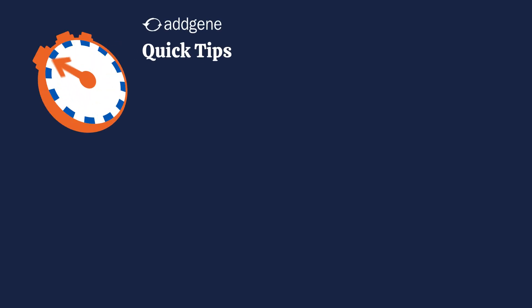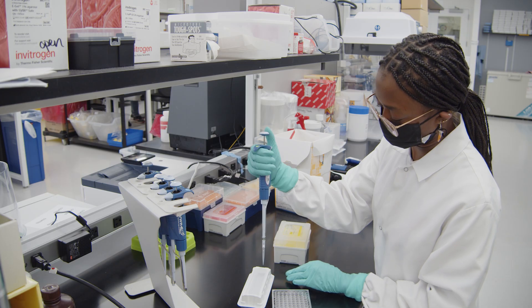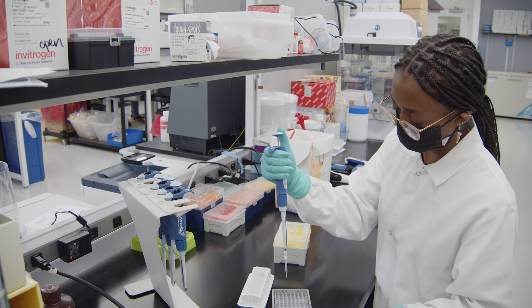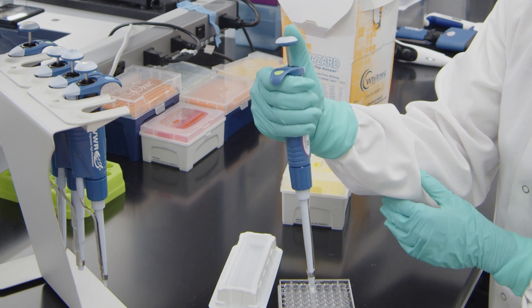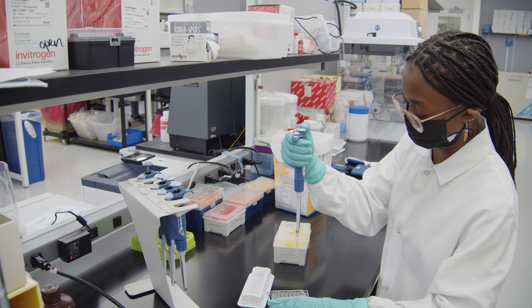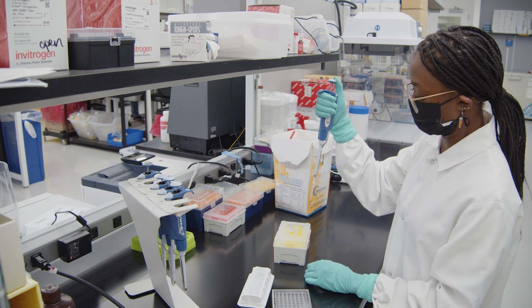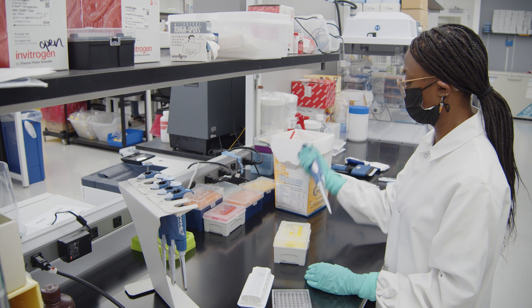Welcome to AdGene's Quick Tips. Let us guide you on your journey to guide your pipette. You'll be pipetting a lot throughout your time in the lab. Keeping your hands steady can be challenging. That can lead to poor technique, which can lead to inaccurate measurements and errors, causing your experiments to crash like a tired arm.